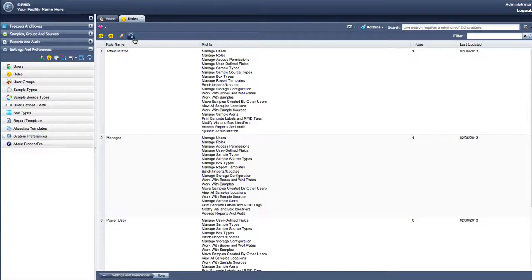This concludes the general configuration managing roles video tutorial. Up next, we will discuss managing user groups.